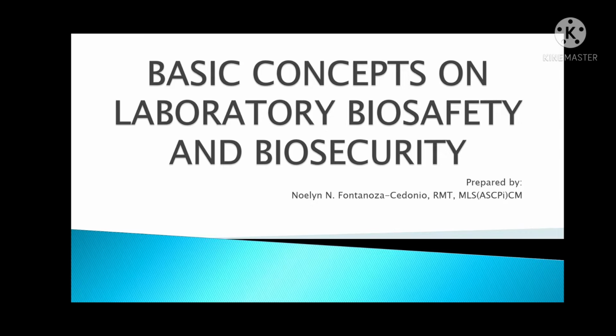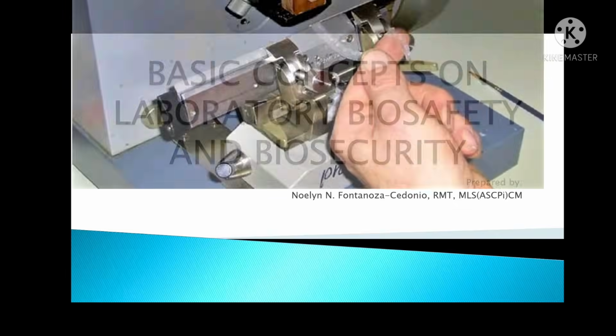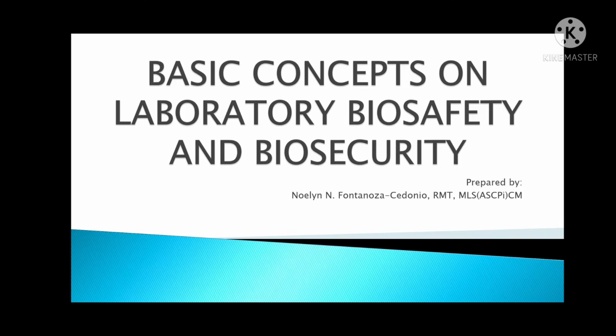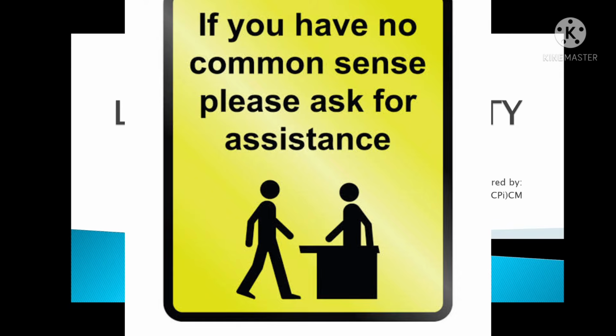As we all know, class, the clinical laboratory contains a variety of safety hazards, many of which are capable of producing serious injury or life threatening diseases. To work safely in this environment, laboratory personnel must learn what hazard exists inside the laboratory, the basic safety precautions associated with them, and how to apply the basic rules of common sense required for everyday safety.